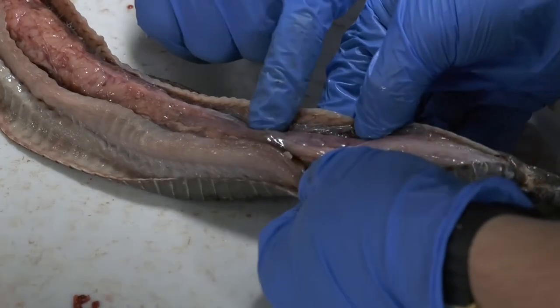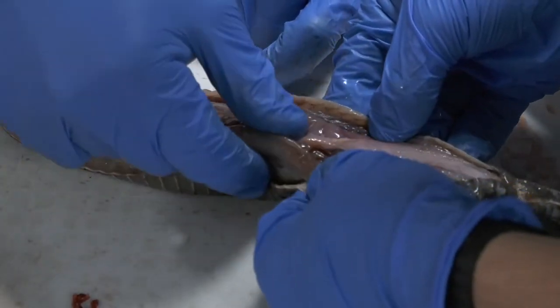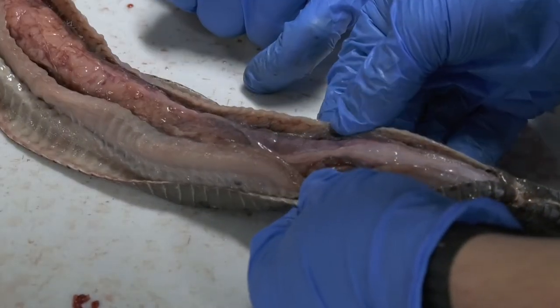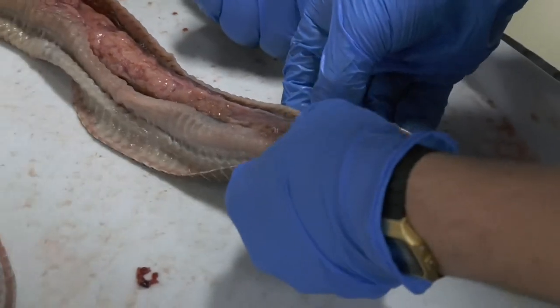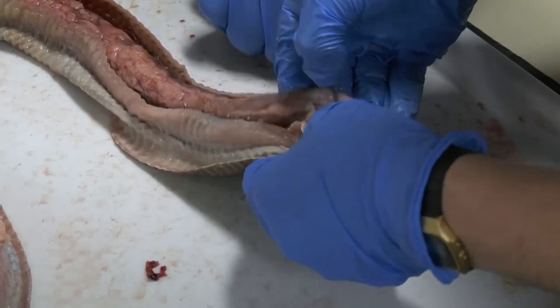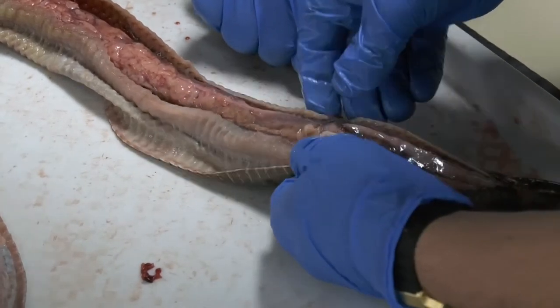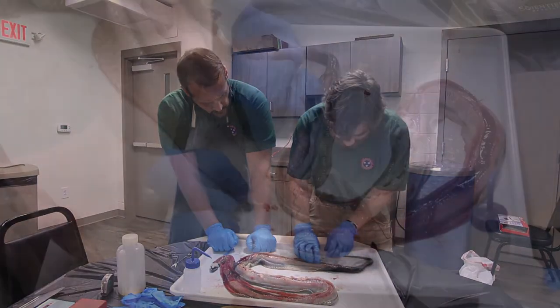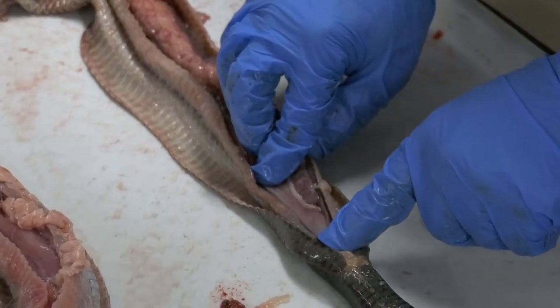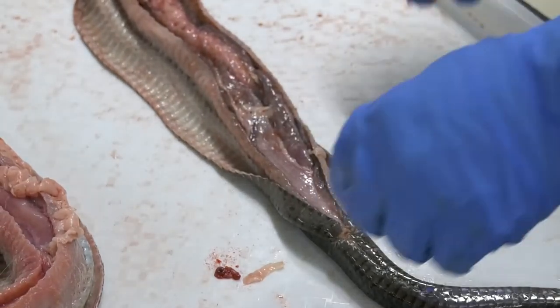No, see, I was just assuming that this right here was large intestine, but according to the book over here, it looks like this right here is the kidney. Elongated, like a lot of their other organs. And just one kidney. And I noticed the book said left kidney. So do all snakes only have a left kidney? So we have the cloacal organ right here, this light colored organ. And you can see when I push on it a little bit of musk and gross stuff comes out of the cloaca. So that's always fun.